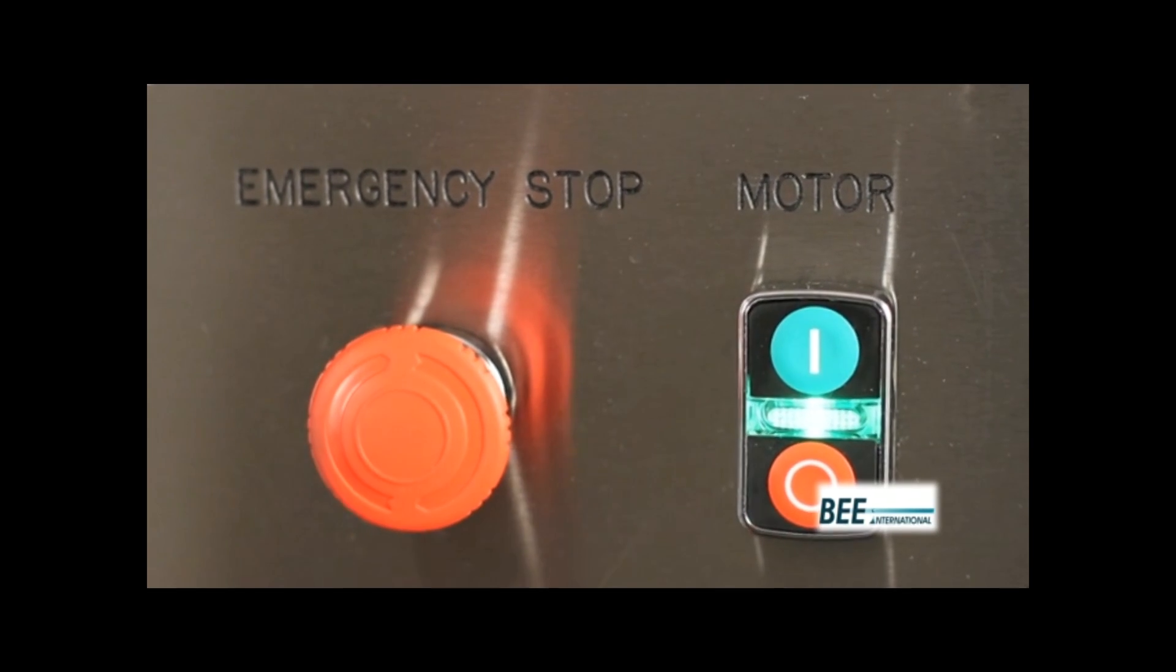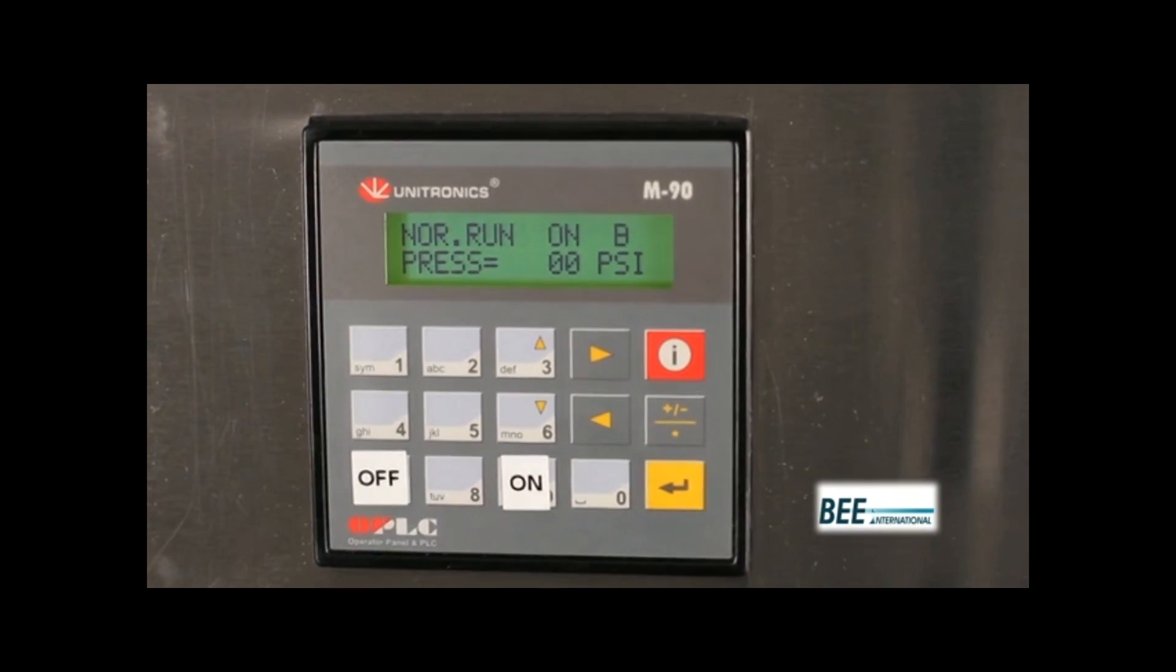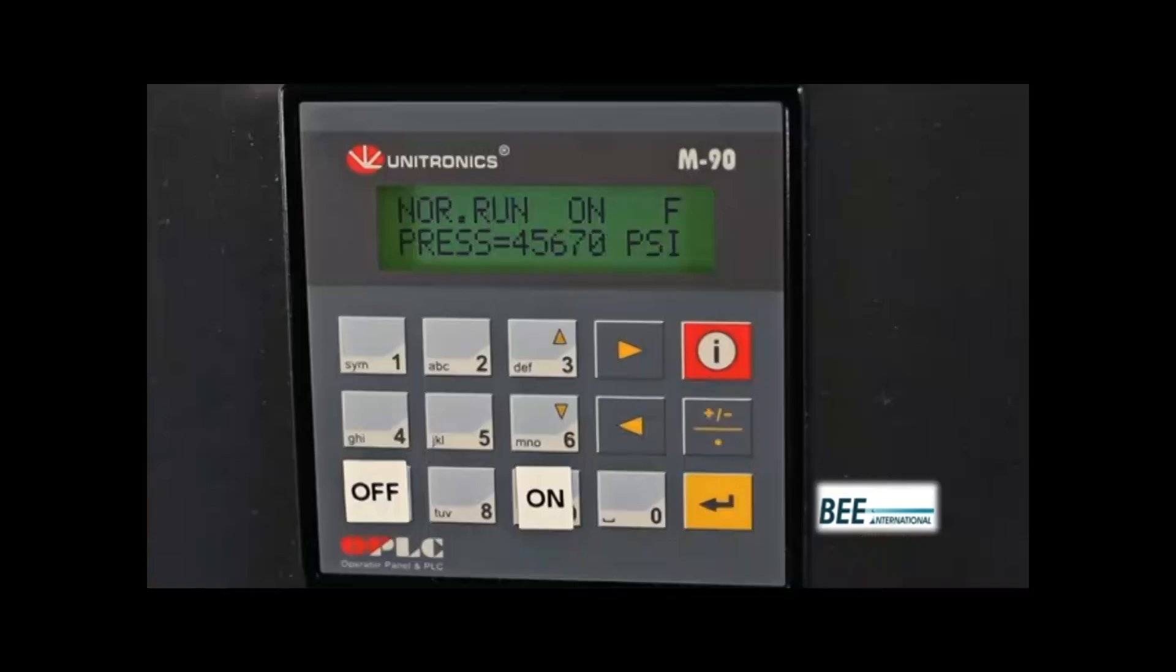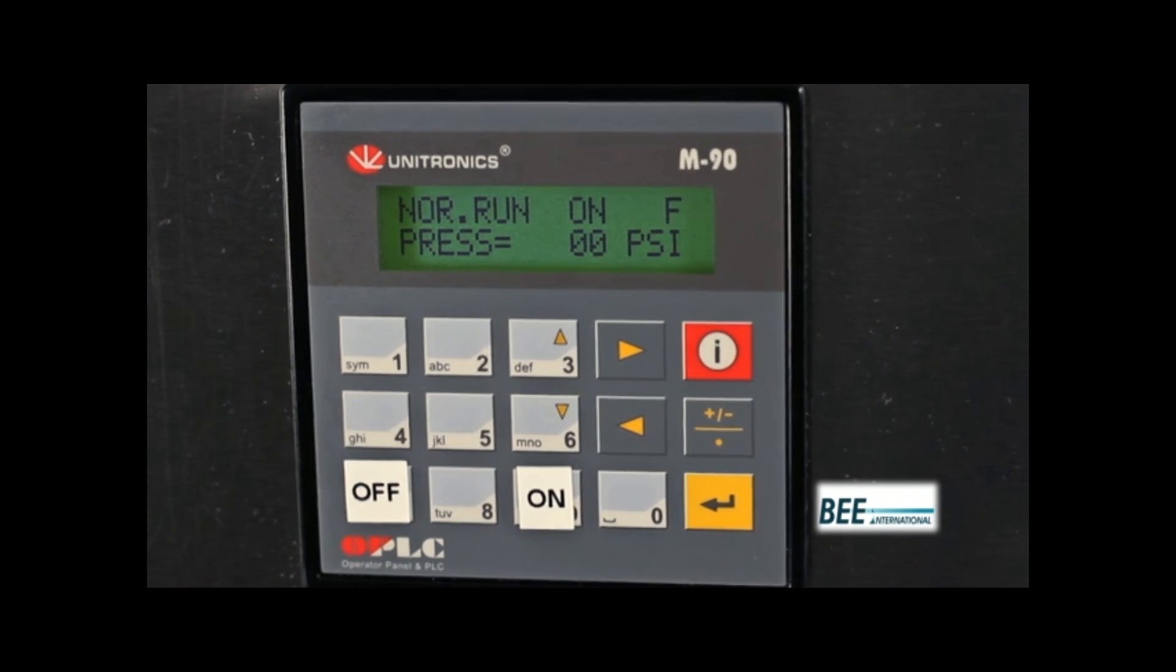Turn on the intensifier pump by pressing the on button on the PLC display. Process pressure is displayed on the PLC. Turn the pressure set dial to adjust the process pressure anywhere up to 3,100 bar or 45,000 PSI.